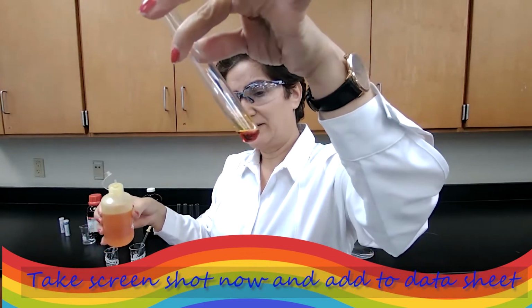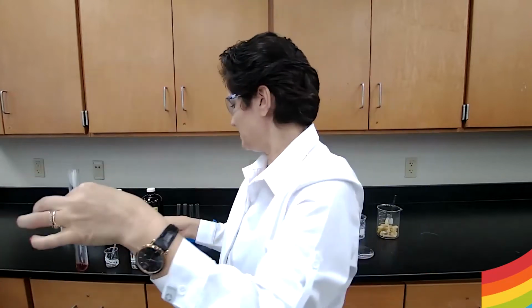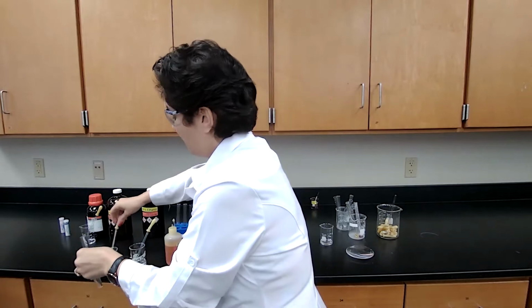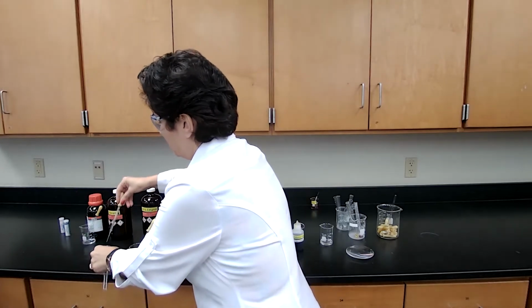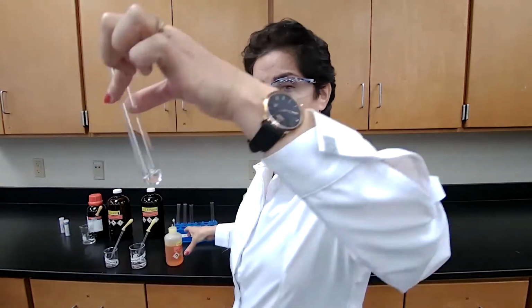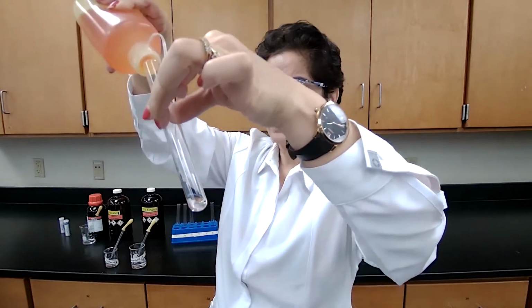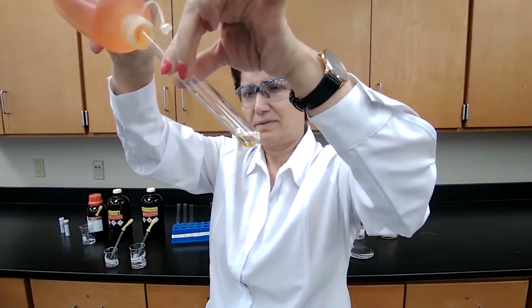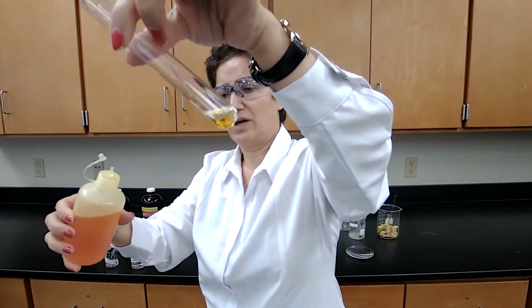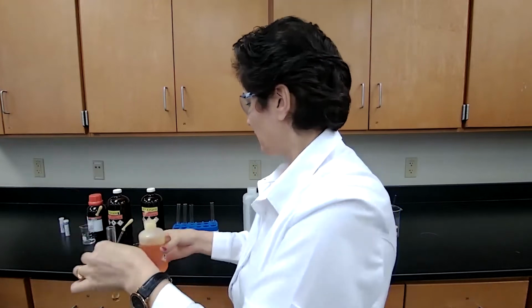Record your observation for unknown A plus ceric nitrate. And the next one, unknown B, is the unknown B plus the ceric nitrate. Record your observation for unknown B plus ceric nitrate.